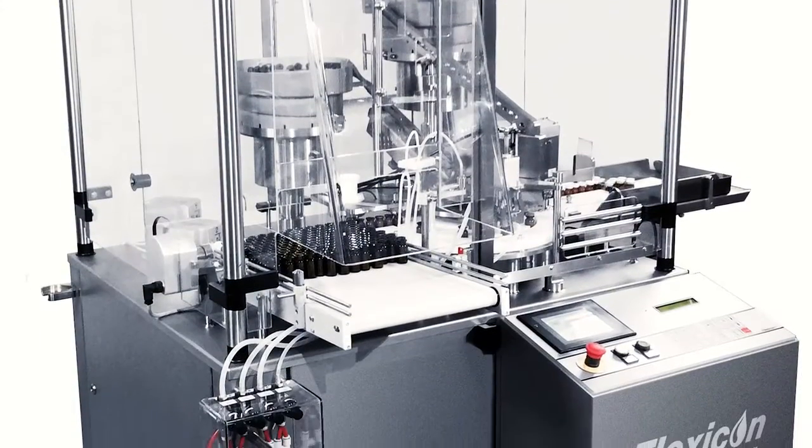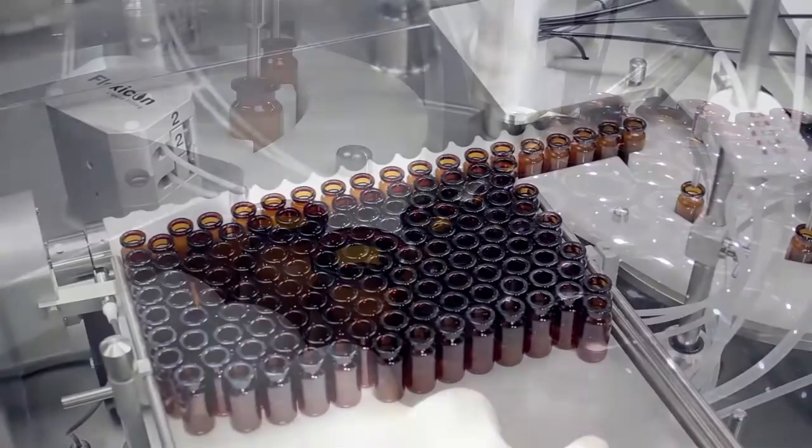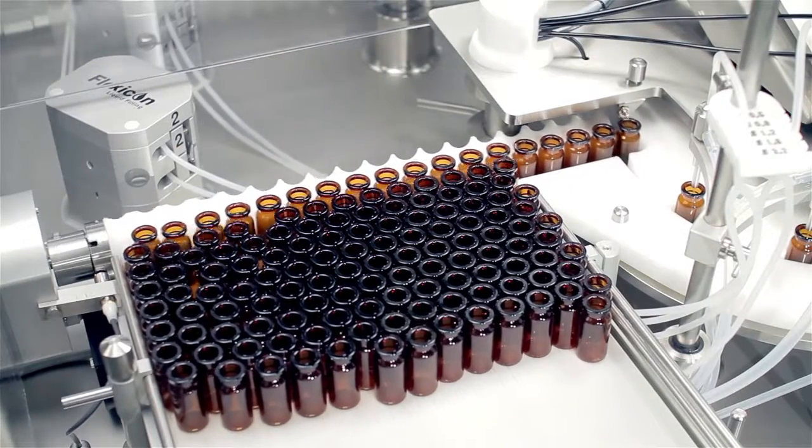The system is modular and easily customizable. Vials can be fed from rotary tables or, as shown here, a more compact infeed conveyor.